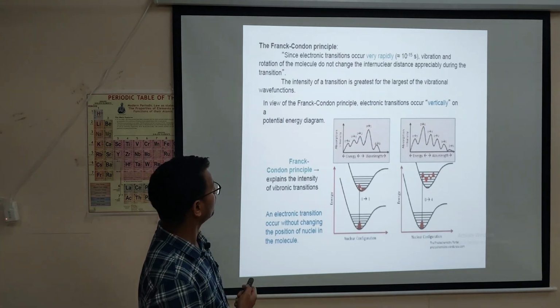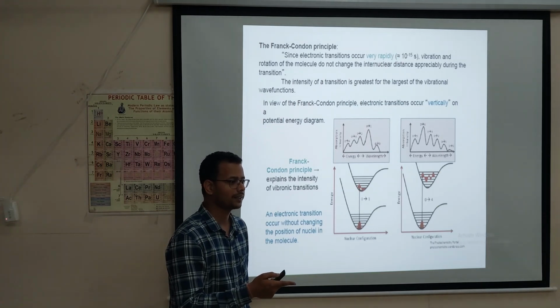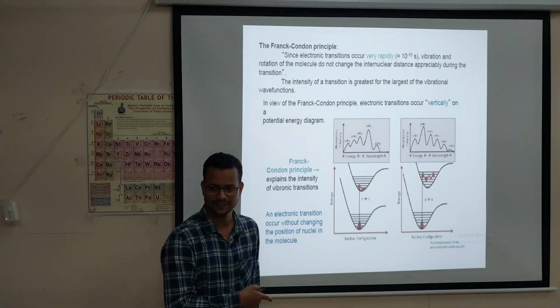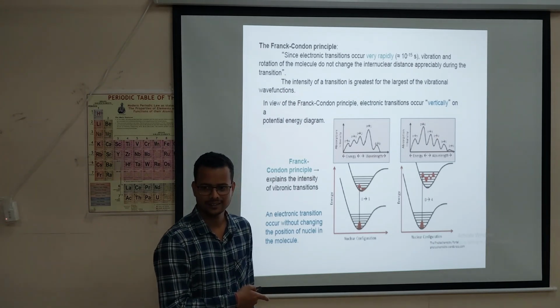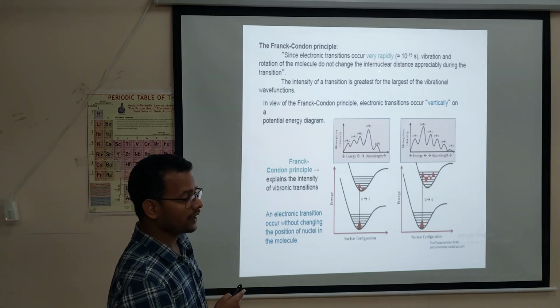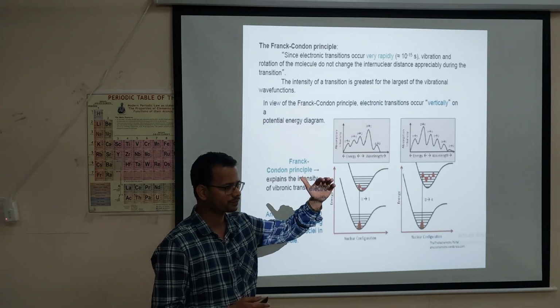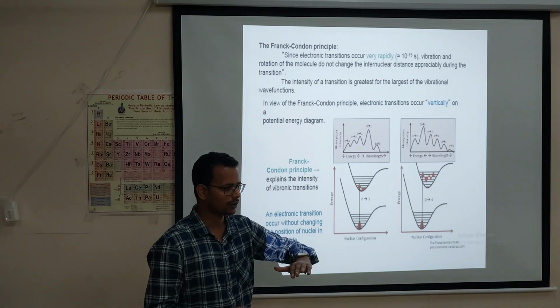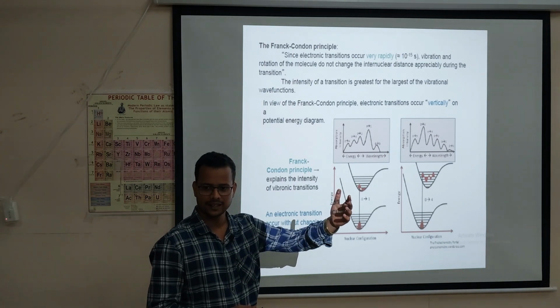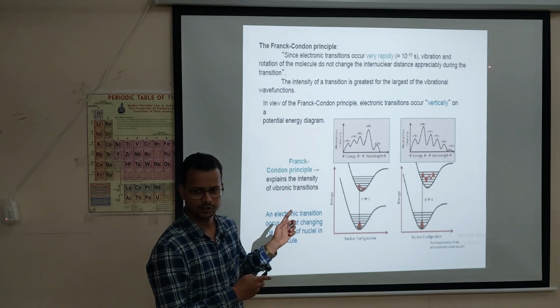Anyway, the governing principle. For liquids we studied the Beer-Lambert law. For solids, it is very important. Here, electronic transition occurs very rapidly. Transition means, you know, there is the Jablonski diagram; you have some idea about that. Singlet state, triplet state, and the time span is very short. It is 10 to the minus 15 second, a femtosecond.